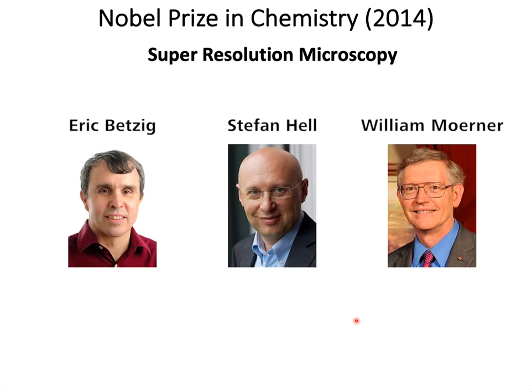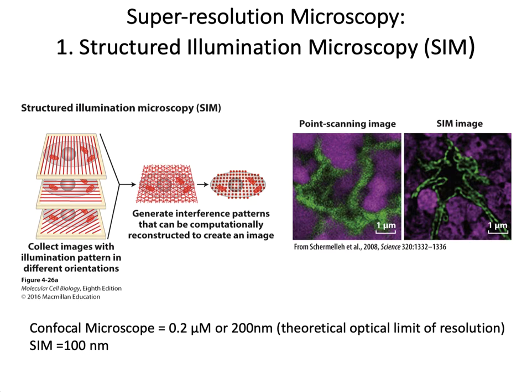Please note that super-resolution microscopy is a generic name and is not just one type of microscope or technique. Rather, there are several different types of systems and techniques, used as per the need and application. The first breakthrough that sets super-resolution microscopy apart is that they can generate light microscope images with up to a nanometer resolution. New approaches to super-resolution microscopy circumvent the light microscope's theoretical limit of resolution, or the ability to distinguish two close objects.